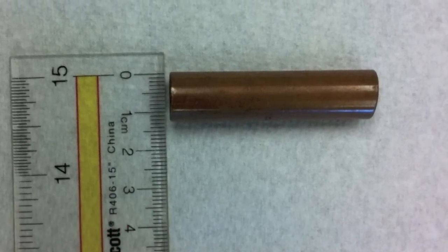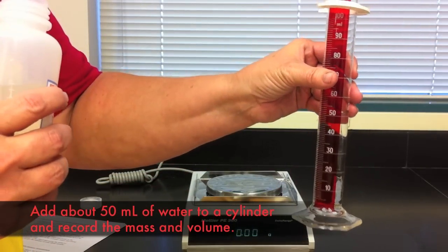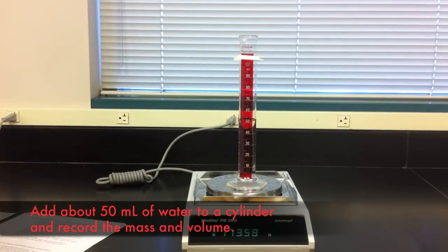A simpler and more accurate measurement of the volume of a solid can be achieved through displacement. To do this we'll take a larger graduated cylinder and fill it with about 50 milliliters of water.